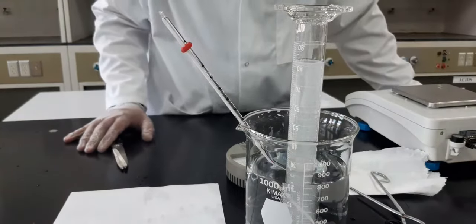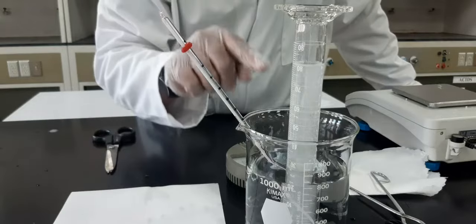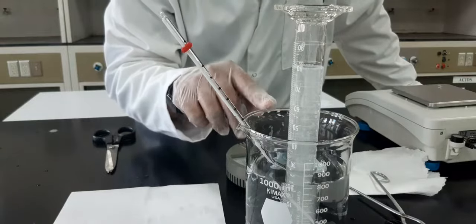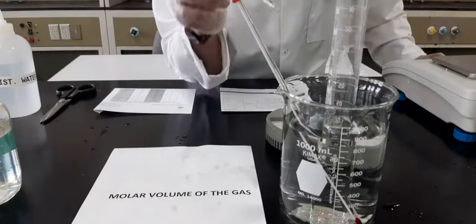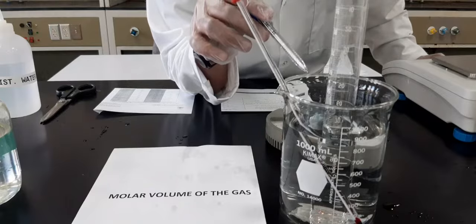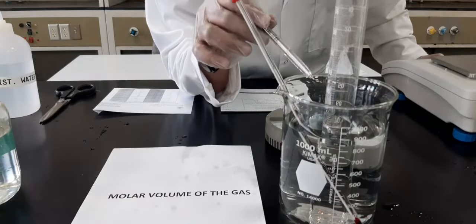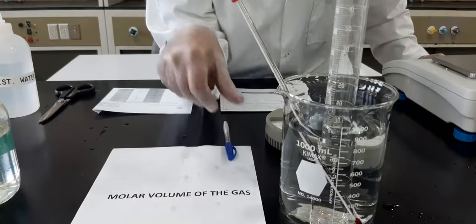Now you're going to wait for this reaction to finish. And how will you know the reaction is finished? Once you see no bubbles coming out of the liquid, it means the reaction is finished. It means all the magnesium has been used. Okay, so now as we can see, there are no bubbles coming out. That means the reaction is finished. That means the magnesium, which we took from the balance, 0.078, has been completely utilized, and the copper is still there. Now it's time for us to take the observations.